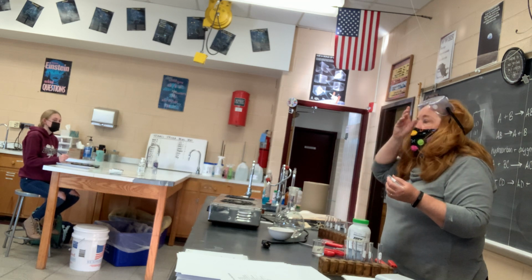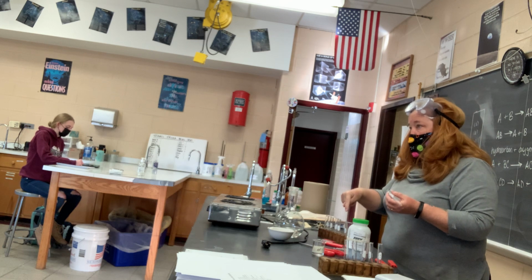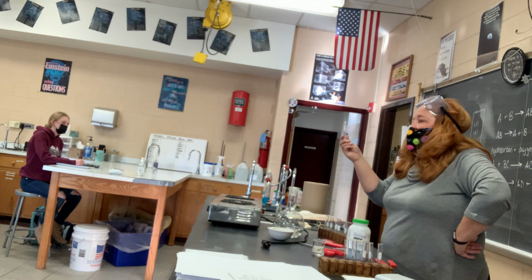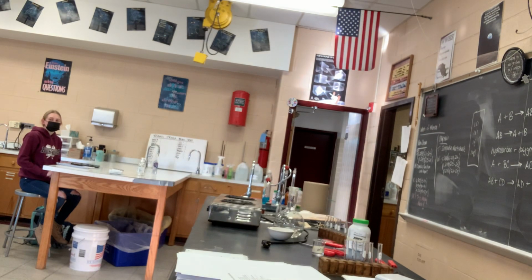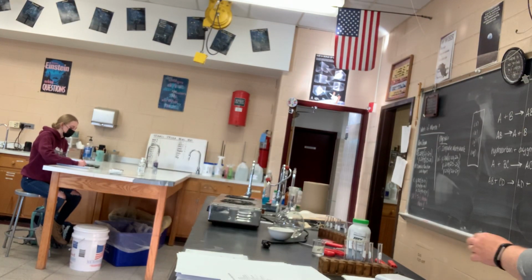So you need to figure out what was made when the zinc was added to the hydrochloric acid, and then what am I trapping in here? It looks like nothing, it's clear. And when I'm done, there is a liquid, a clear condensation on the inside of the test tube, after I light whatever I put in here on fire. So see if you can figure that out. That'd be like a bonus. But it was definitely a single replacement.